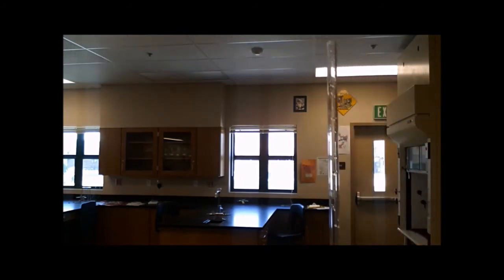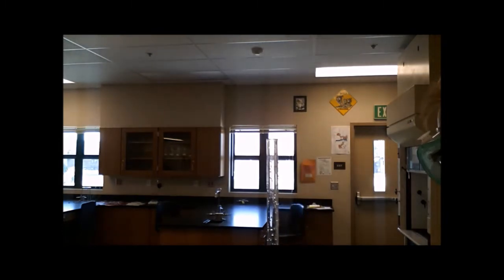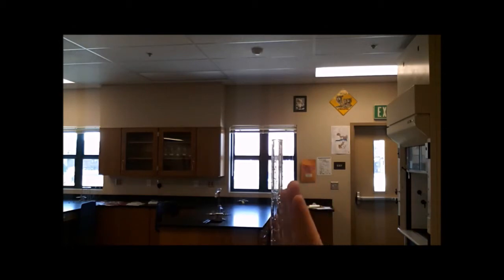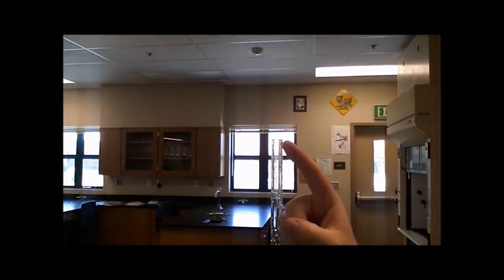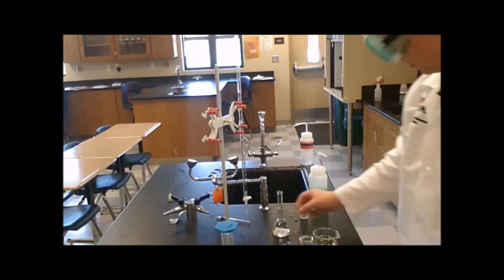Now what's in here is actually sodium hydroxide, the same solution that we're going to load this thing up with. The reason I did that is because if you leave it with deionized water inside the burette, when you go to add the sodium hydroxide, it will dilute the sodium hydroxide and it's no longer what you thought it was. It's no longer the same concentration that you expected it to be. So the time has come to load the burette up with sodium hydroxide.